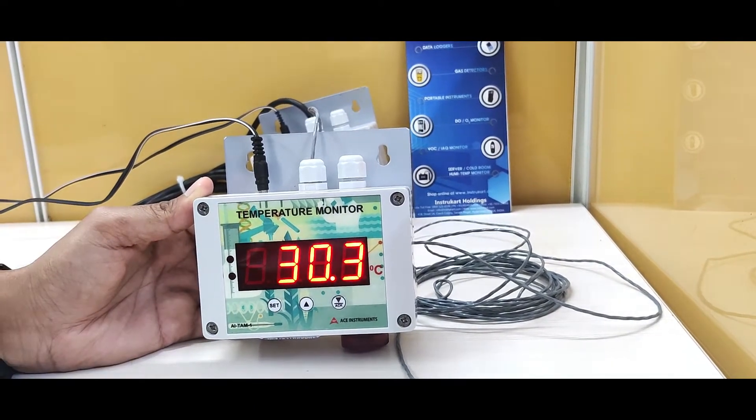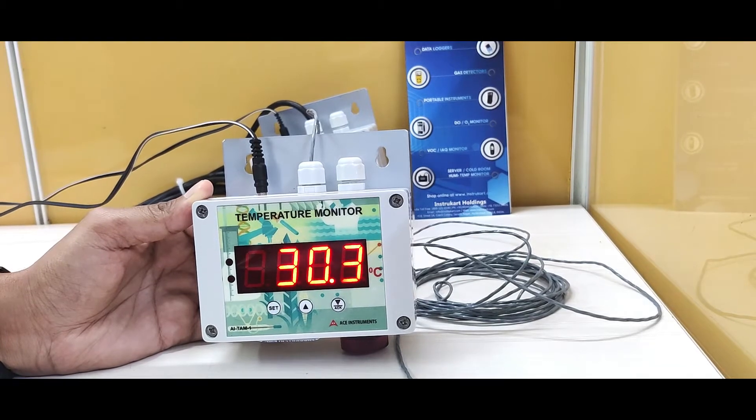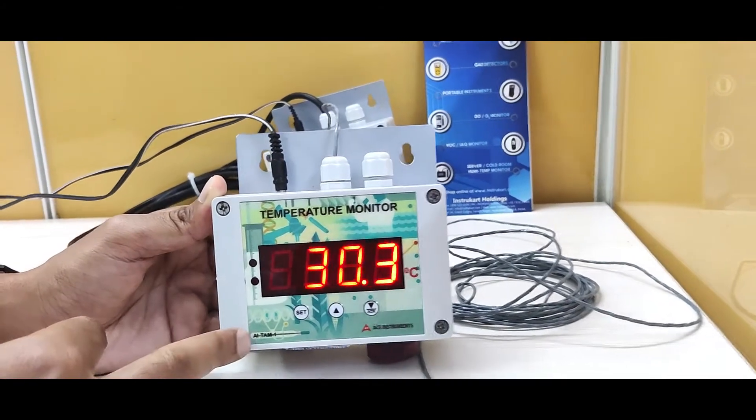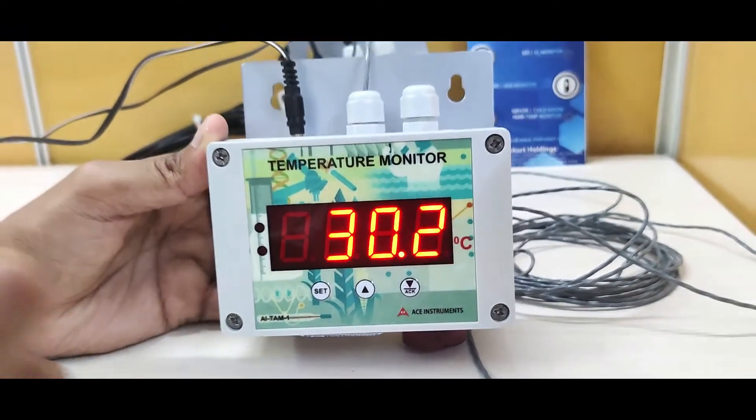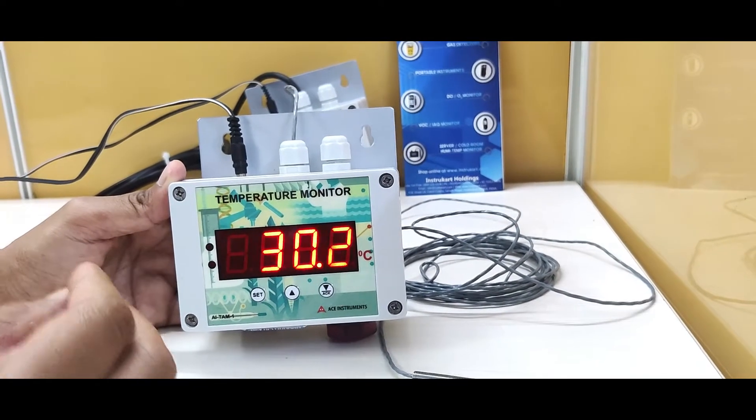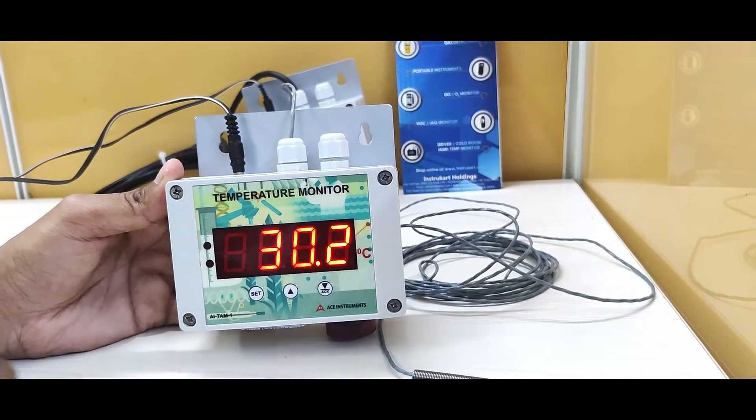This device is manufactured by Ace Instruments, our own manufacturing unit. The model number is AITAM1, which is specifically meant to measure the temperature in a specific area.